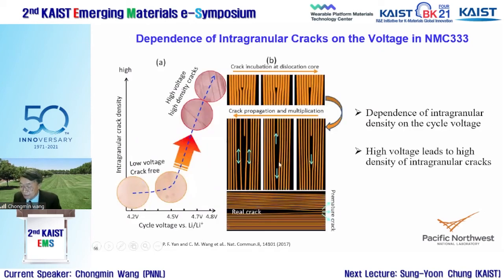That's one thing. And we definitely can measure this so-called cracking density, and with the voltage, actually, you can see at a lower voltage you get a lower density, and at a higher voltage the cracking density increases. That's apparently correlated with what's going on with the voltage in here. And the true nature of this, I think I will mention again in my summary.